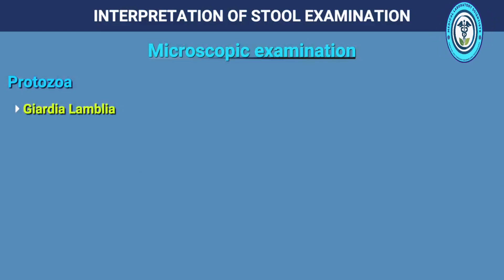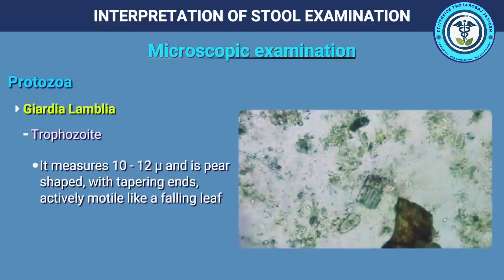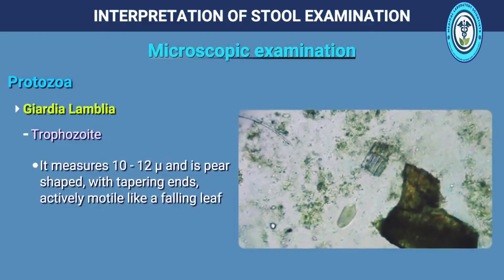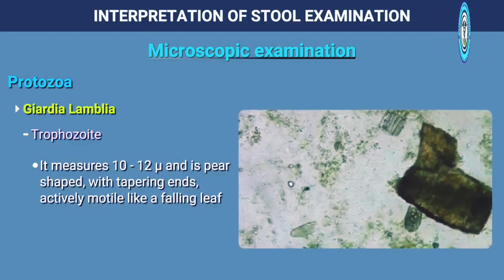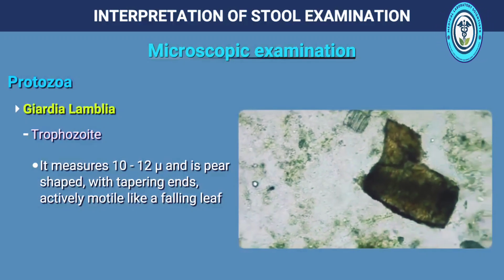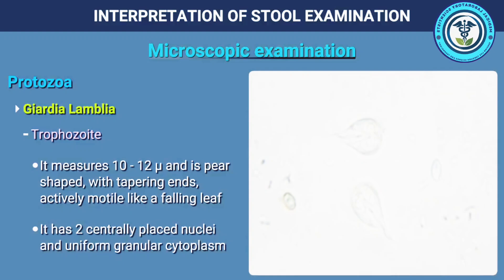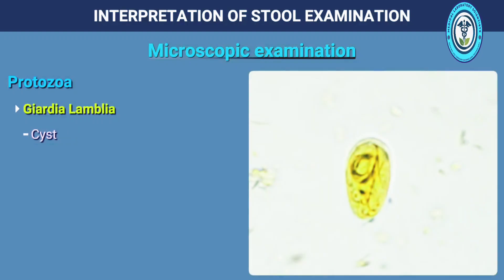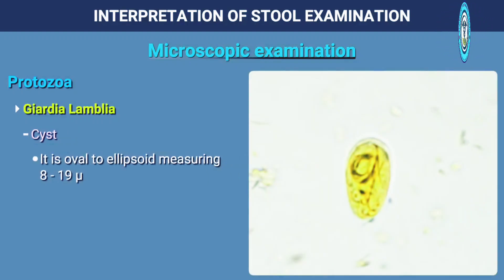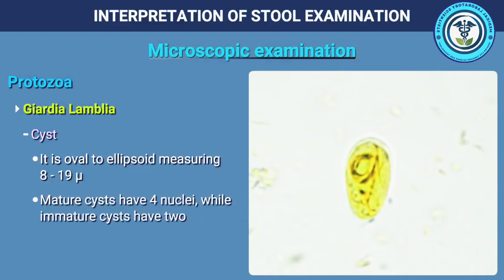Giardia lamblia trophozoite measures 10 to 12 microns. It is pear-shaped with tapering ends, actively motile like a falling leaf, and has 2 centrally placed nuclei and uniform granular cytoplasm. The cyst of Giardia lamblia is oval to ellipsoid in shape, measuring 8 to 19 microns. Mature cysts have 4 nuclei while immature cysts have 2.